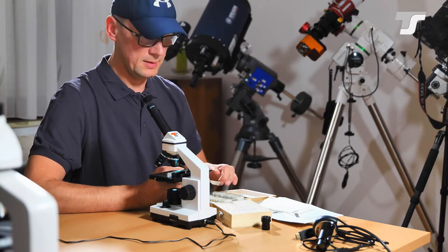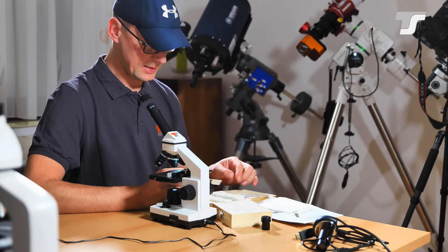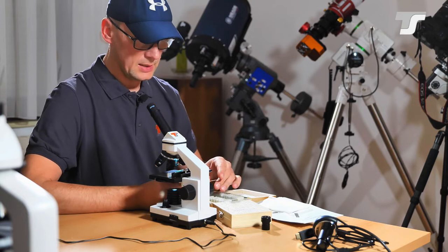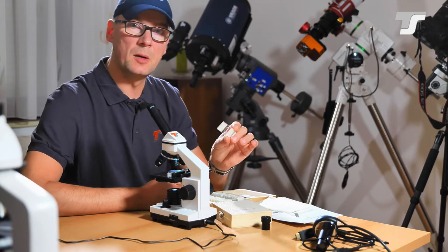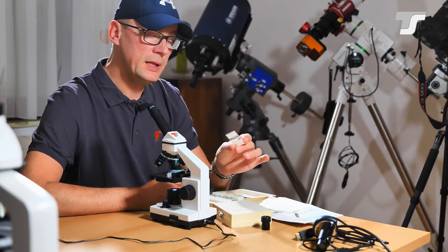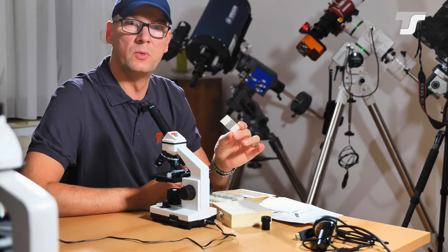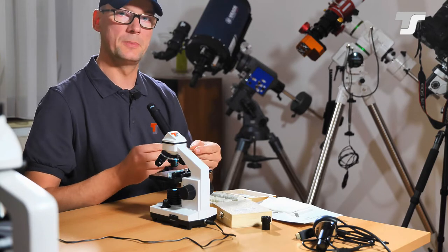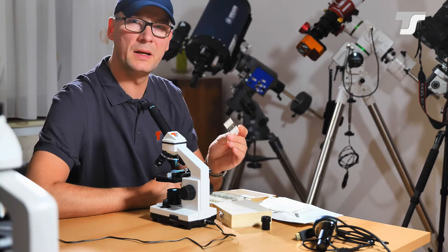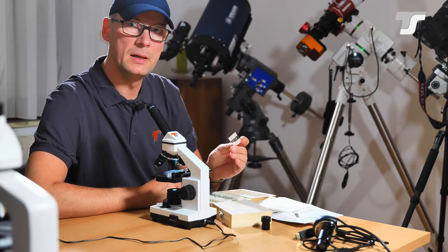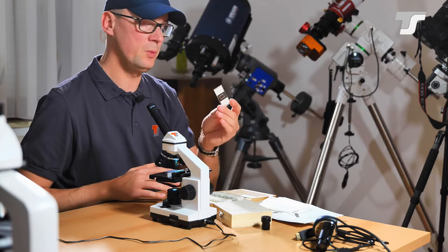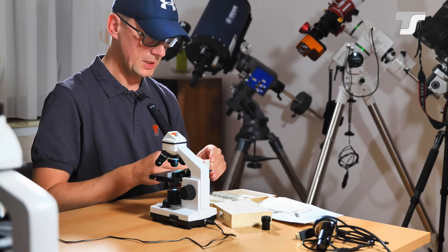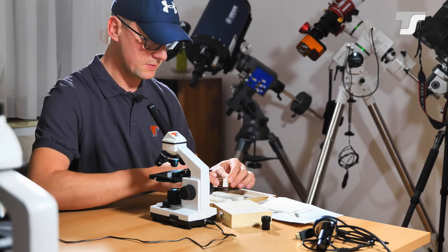And these samples are pretty good prepared. So you get the label to it. In this case here German and on the right side is English. And these samples are prepared to stay a long time. Normally you would prepare a sample with water in between the lower glass plate and upper glass plate. But in this case here I think it's some sort of epoxy that will seal the subject completely and they will last years. So no problem to have them a very long time. If you take care of the glass itself they will last forever.